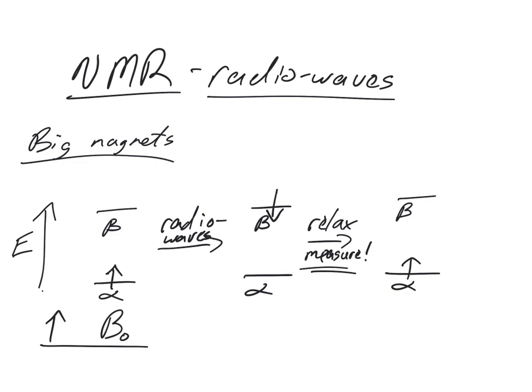Now let's talk about what an NMR actually tells us. Let's think about what we can learn from NMR, looking at a specific molecule. That molecule is drawn up here. It's an ether. Whenever you're doing analysis with NMR, the first thing I would do is draw in all the hydrogens. So all the hydrogens are drawn in. What is the first thing an NMR tells us about? We have all these different types of hydrogens, and every hydrogen has a different state. So it tells us about the types of hydrogens.